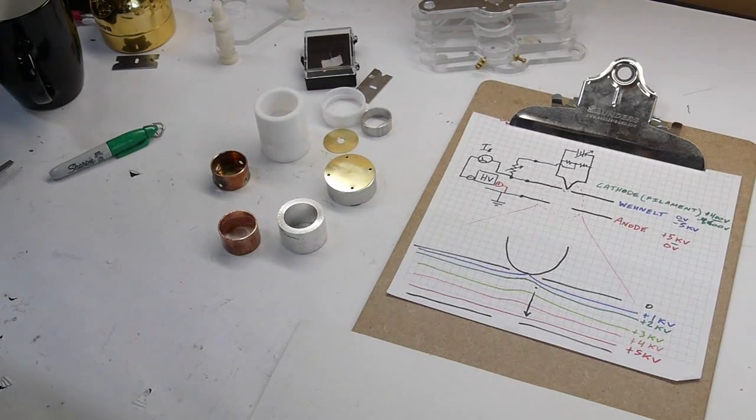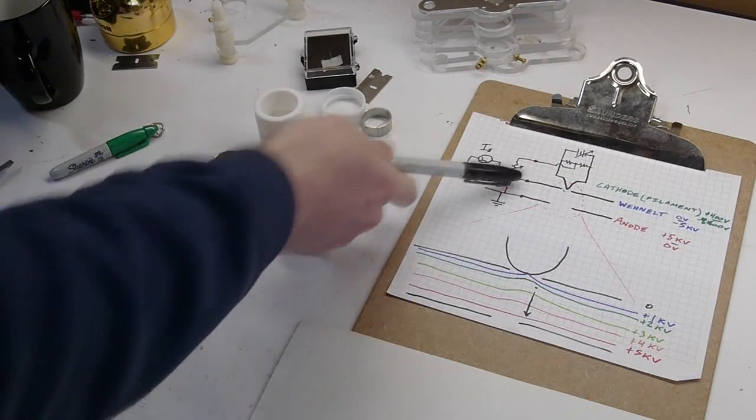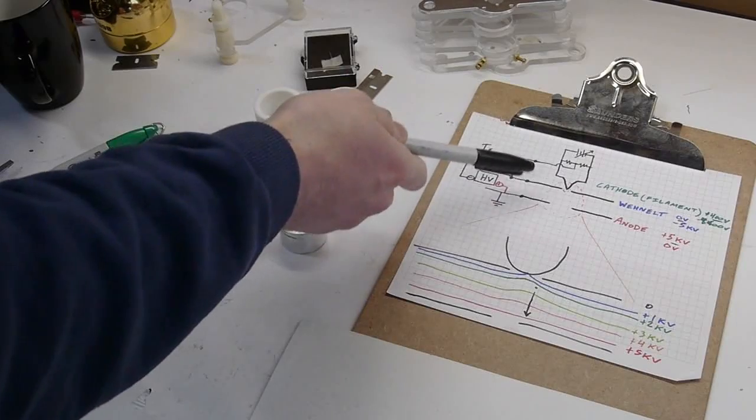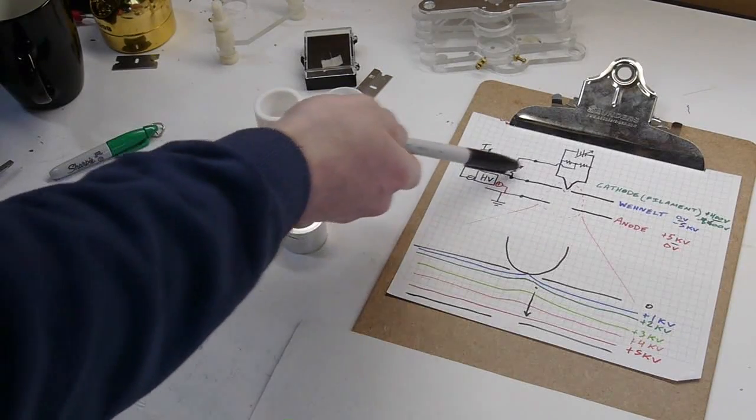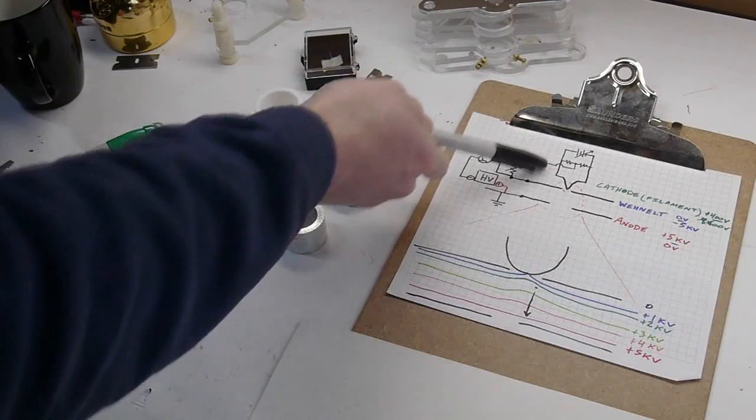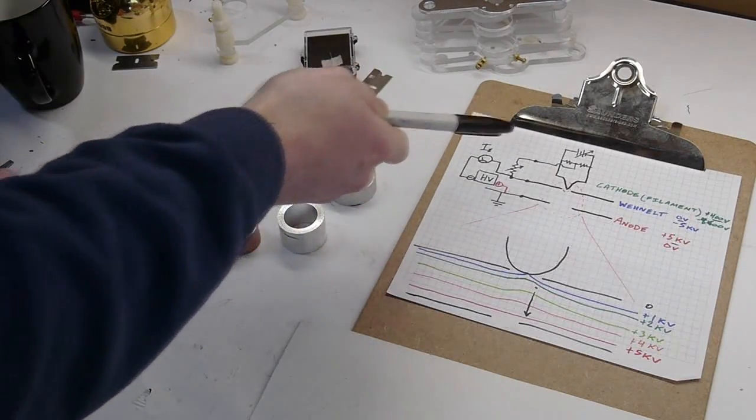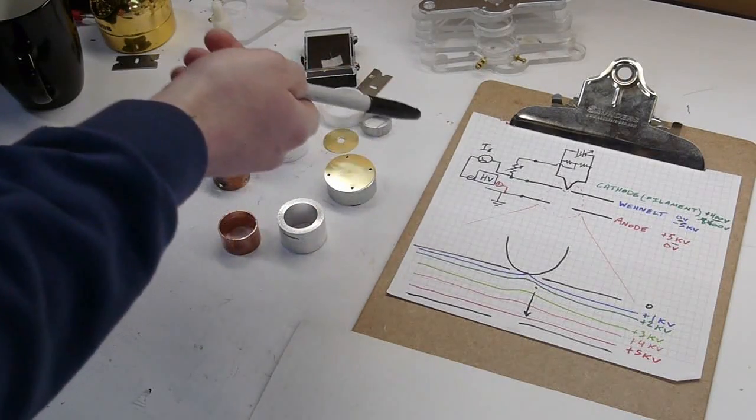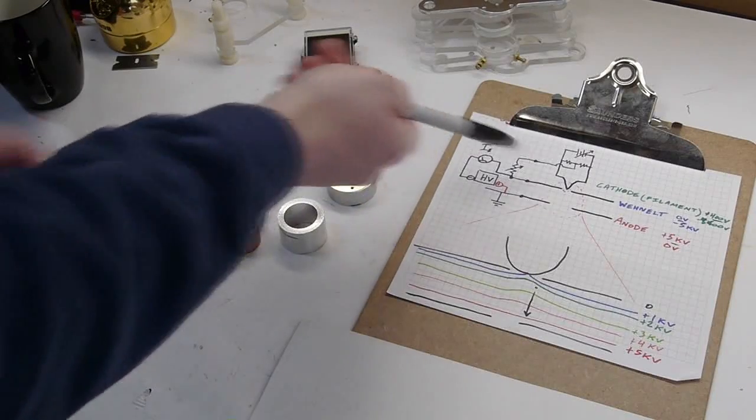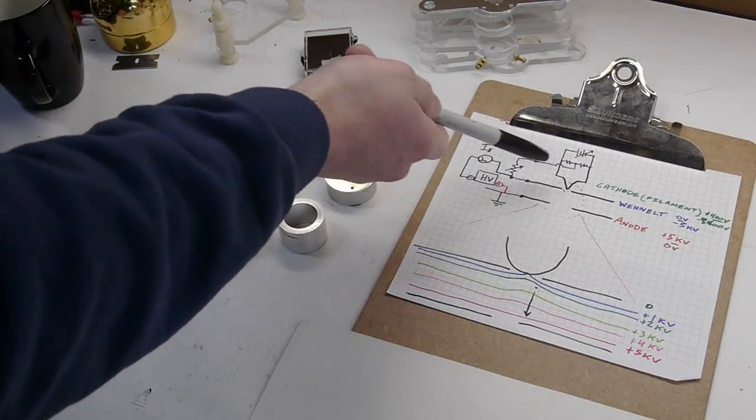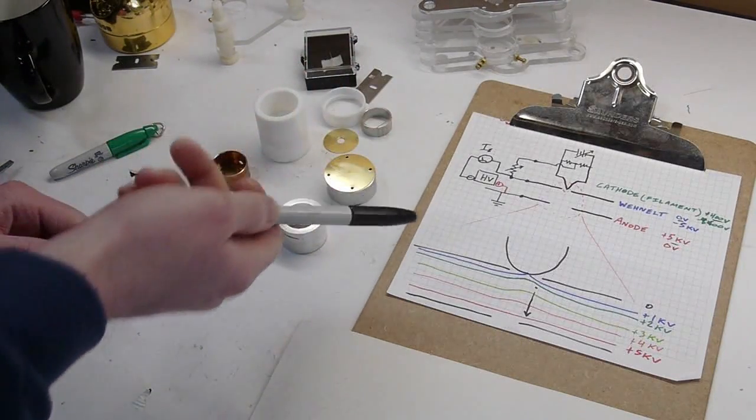Okay, so hopefully that is starting to make sense. Basically what we've got here is three different voltages on the filament, Wenelt, and anode. And I said that by adjusting this variable resistor, the voltage on the filament will change all by itself because it's emitting electrons and it will bias itself basically.